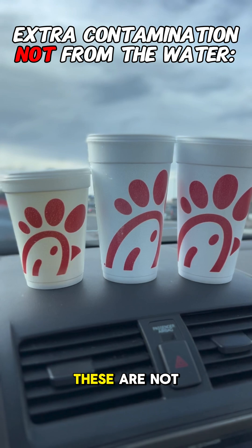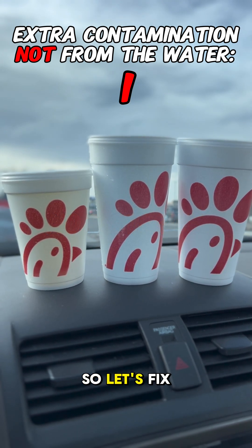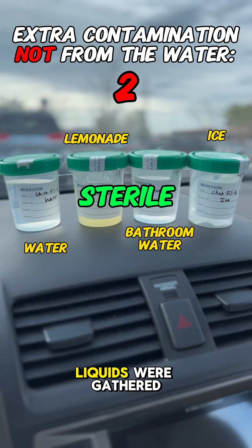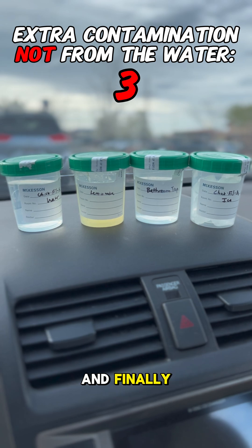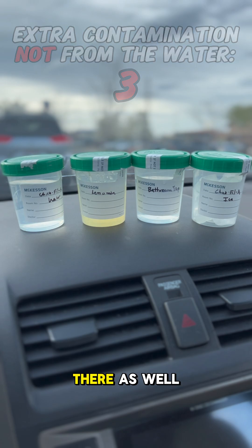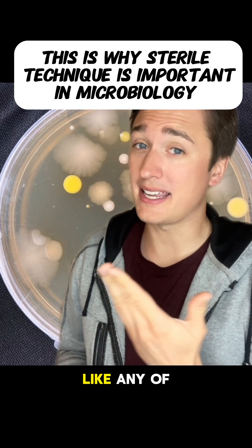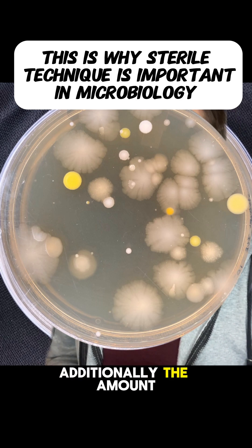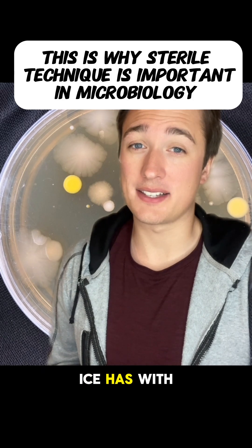As a reminder, these are not sterile cups, so there is a chance contamination can come from them. Additionally, most of these liquids were gathered by the Chick-fil-A employee, so there's potential for contamination there. Finally, the liquids were transferred into these cups in a non-sterile car, so there's a chance of contamination there as well. Contamination could look like any of these growths.